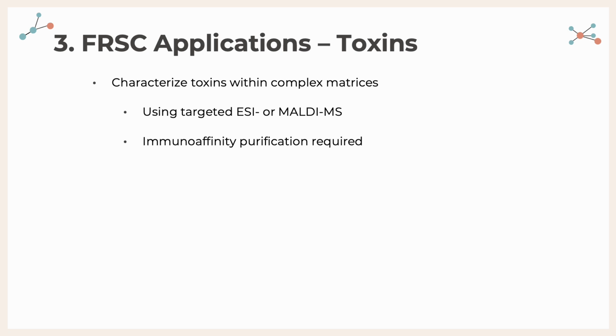But first, you need to purify it, and this requires a specific type of purification. So this is immunoaffinity purification, where you're just using antibodies to extract the protein from the matrix.